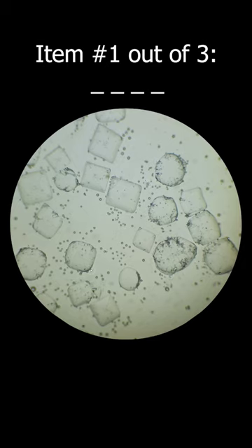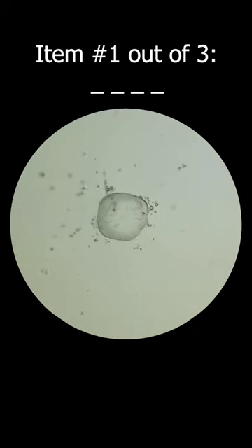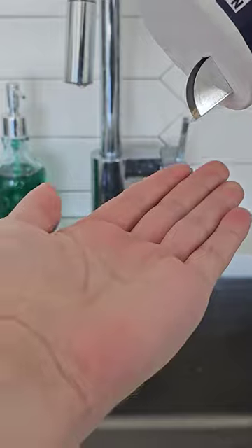This is now sped up, but yes, it's water-soluble. Here's one final look as you lock in your answer. 3, 2, 1, and if you guessed salt, you would be correct.